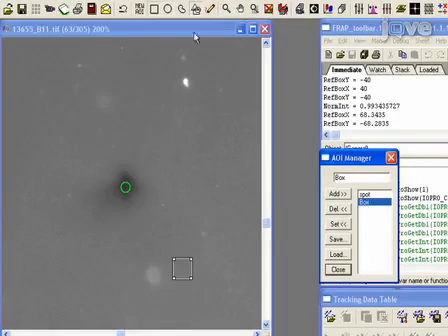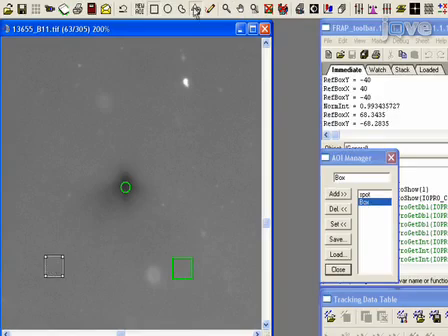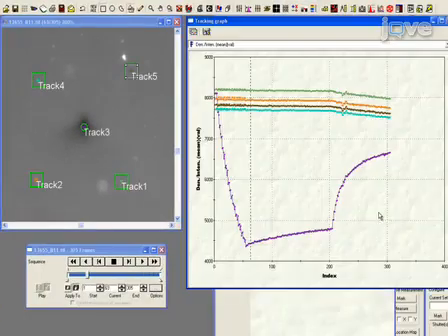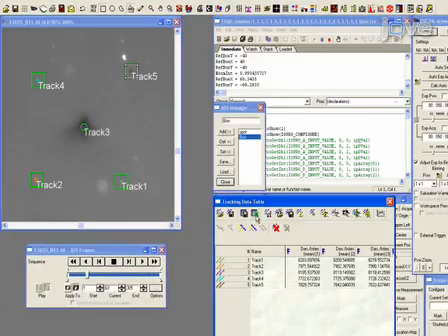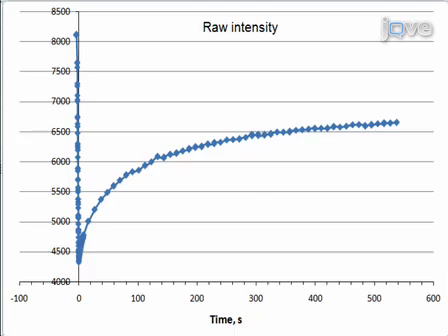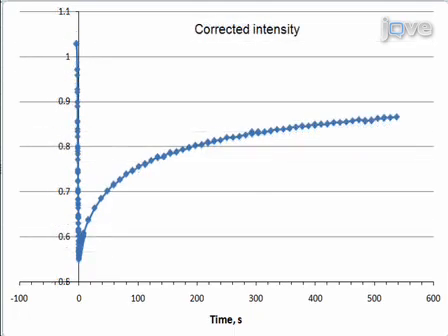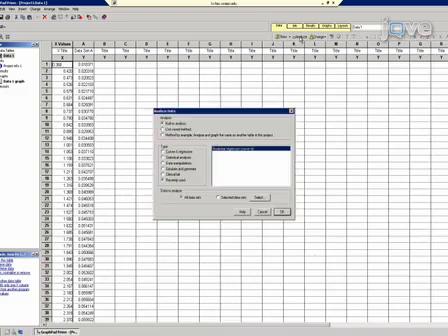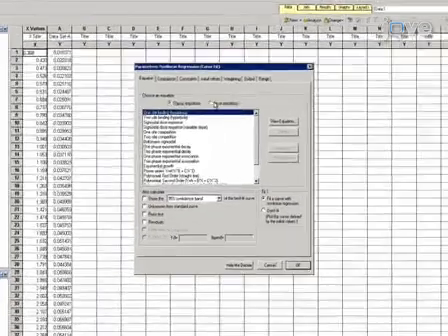After data collection is finished, integrate the intensity inside the bleach spot and 4 reference spots placed outside of the laser bleached area in all frames. Correct the integrated intensity curve for deviations caused by fluctuations of light and bleaching during the data acquisition. Normalize the corrected intensity to make the pre-bleached intensity equal to 1 and the initial bleached intensity equal to 0.